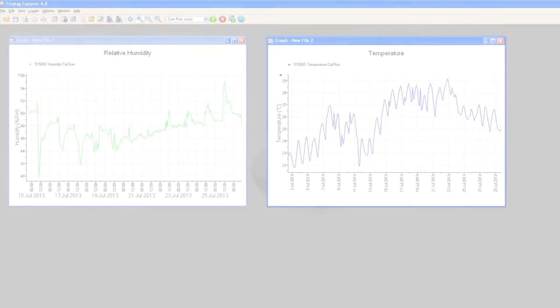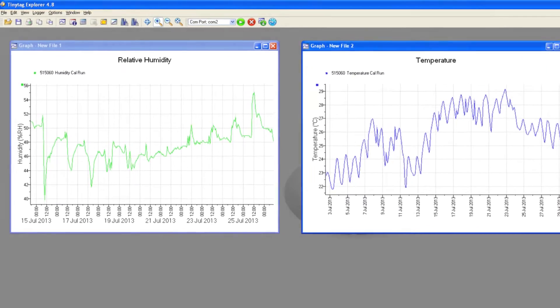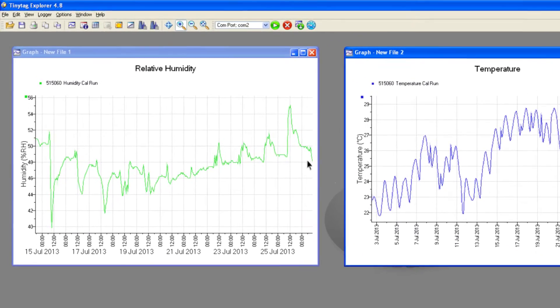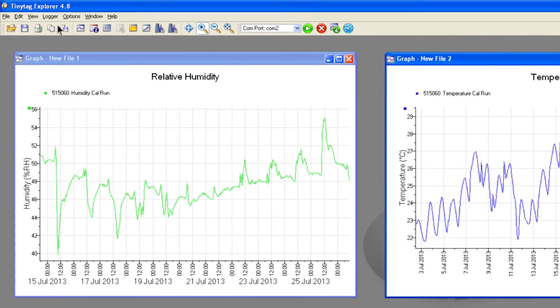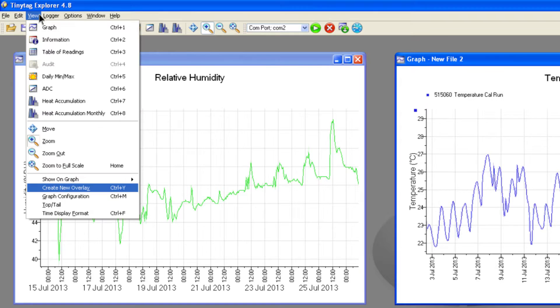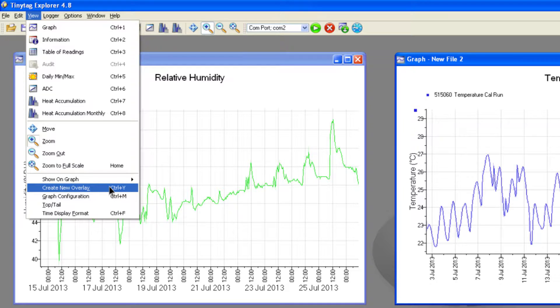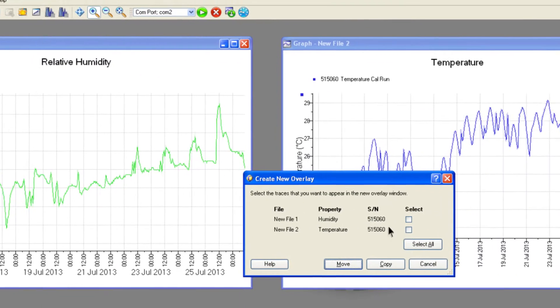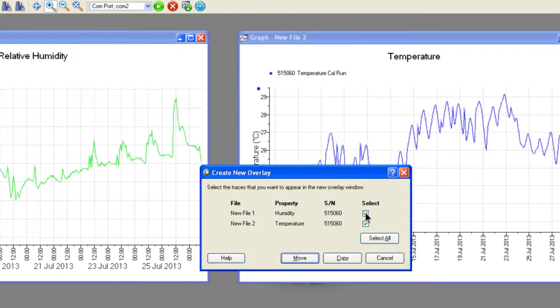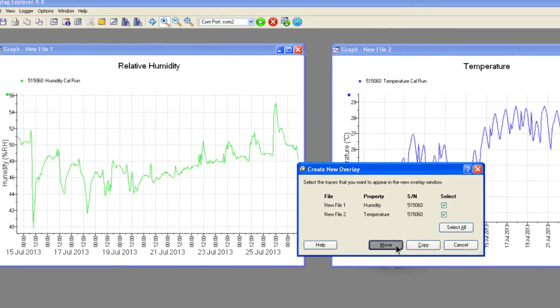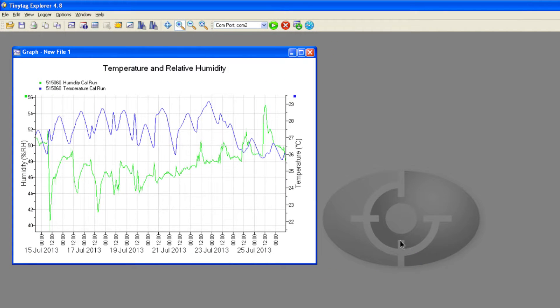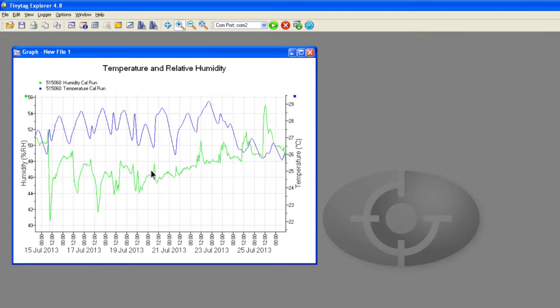To present an integrated view of environmental conditions, data from multiple loggers or logging runs can be combined into the same graph using an overlay feature. For example, this could combine data from a temperature logger and a relative humidity logger into one graph. This enables you to see the effect of one property on another.